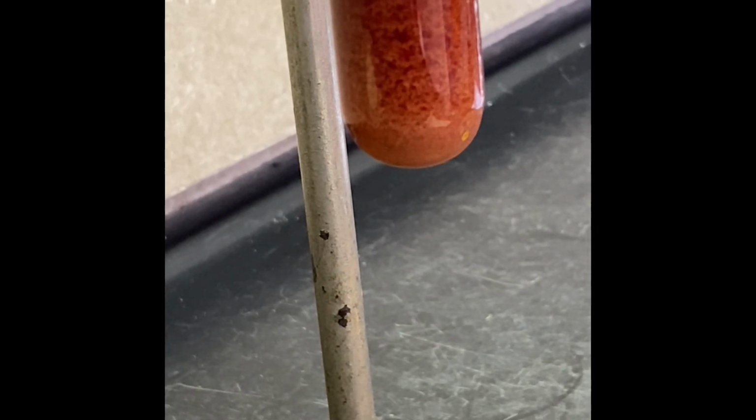During this time, as you're seeing, the crystals getting formed more and more, and we're gonna use tap water, running tap water. Under that water we're gonna let it cool down more and try to get more crystals. After holding running water, as you see, we have more crystals, and now it's ready for filtration.